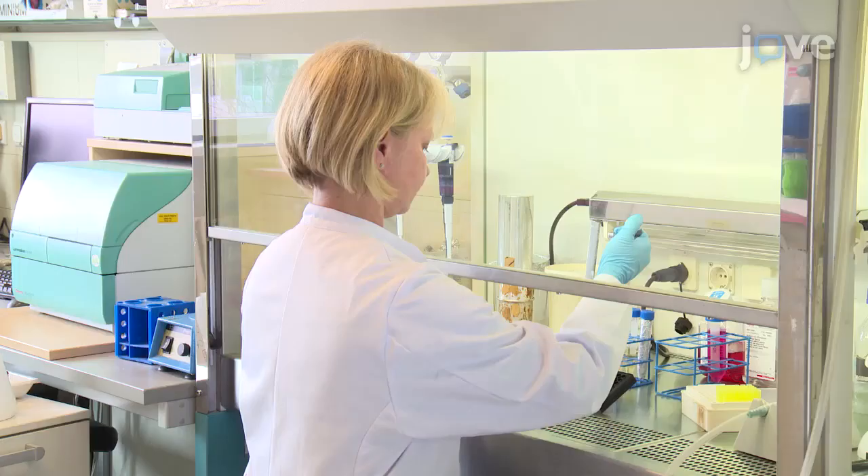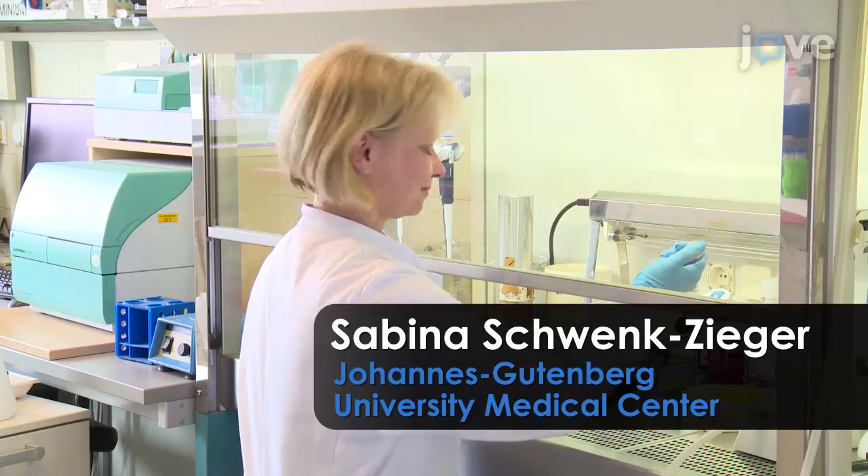It remains to be said that handling primary tumor cells is difficult and does not always lead to reliable three-dimensional spheroid formation. Demonstrating the procedure will be Sabina Schwenk-Zieger, a technician from our laboratory.